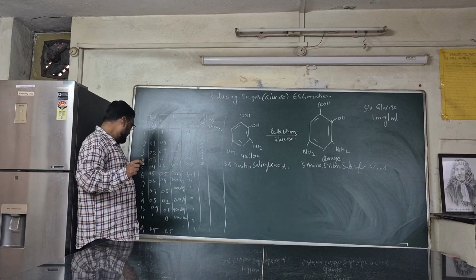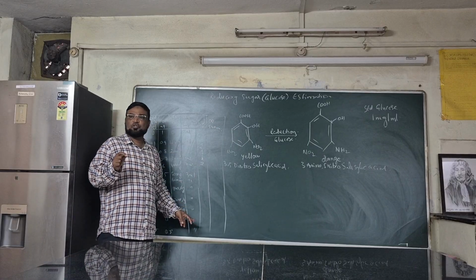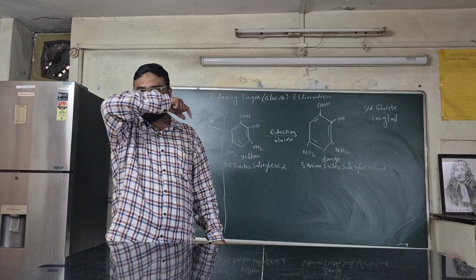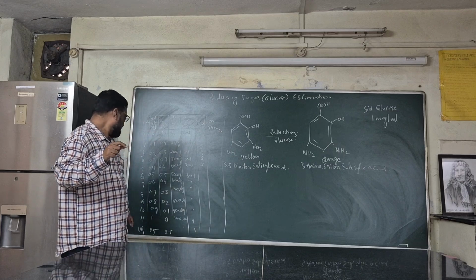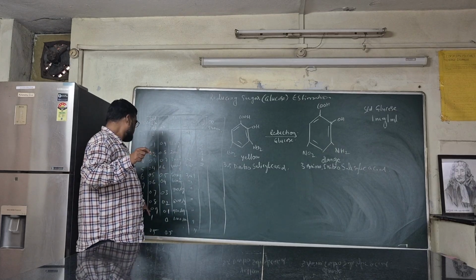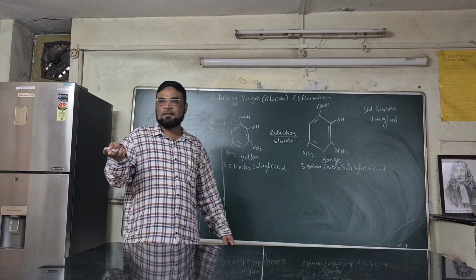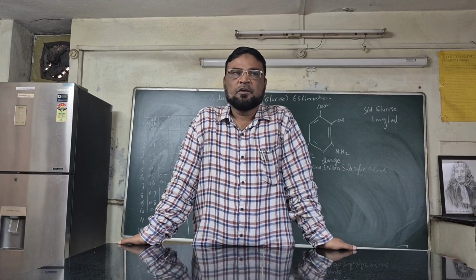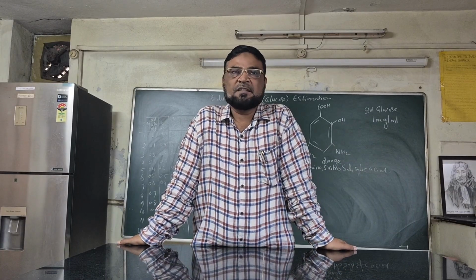That is as it is we are taking. And in all these tubes you are supposed to add 3 ml of DNS reagent. Everywhere 3 ml of reagent should be added. Then you are supposed to take the unknown. By using this standard concentration, you will be getting some values. You will be boiling it in a boiling water bath for 10 minutes.